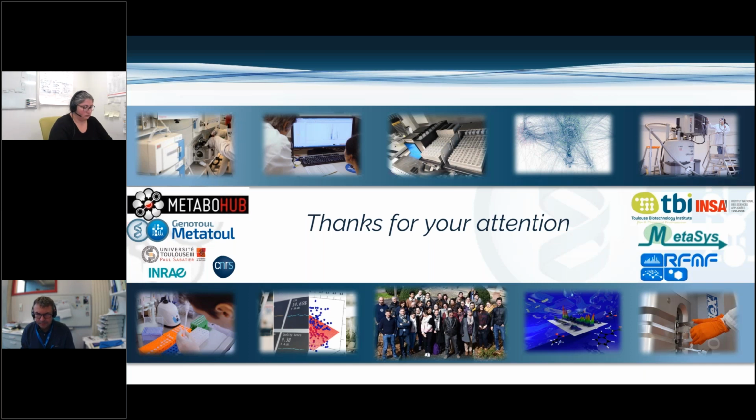Actually, we are not working only with bacteria. This is, of course, the specialty of the lab where we are. And to develop tools for the flux analysis, we are, of course, using microorganisms because they are simpler and easy to grow. But we are working with many other organisms, including animal cells in cultivation, adherent cells in cultivation, when we are also performing labeling on them. And the tools we are developing analytically are actually the same for those cells.